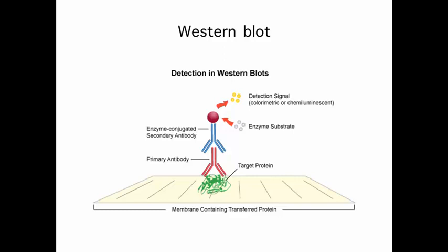Before you add the antibodies, it's actually important to add something called a blocker. And that's because antibodies are also proteins in addition to your aldolase. So any protein will bind to a PVDF membrane. Any protein. Since aldolase is a protein, it binds. Since the antibodies are proteins, they will bind unless you have blocked all the other available sites on the membrane with a very non-specific protein.